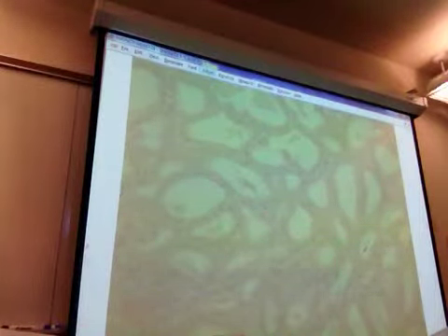So you guys should be able to tell the difference between this and the epididymis. Do you want to see what the epididymis looks like? How would you tell the difference between this and the epididymis? There's no stereocilia. No stereocilia, good. So this is the seminal vesicle. Other than the actual glandular epithelium, not really. Just individual seminal vesicles.